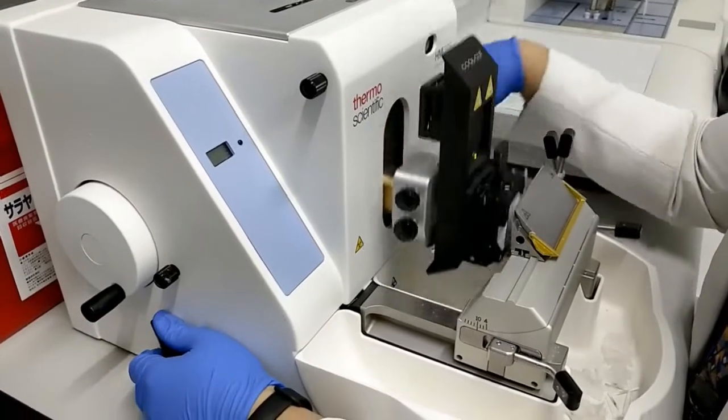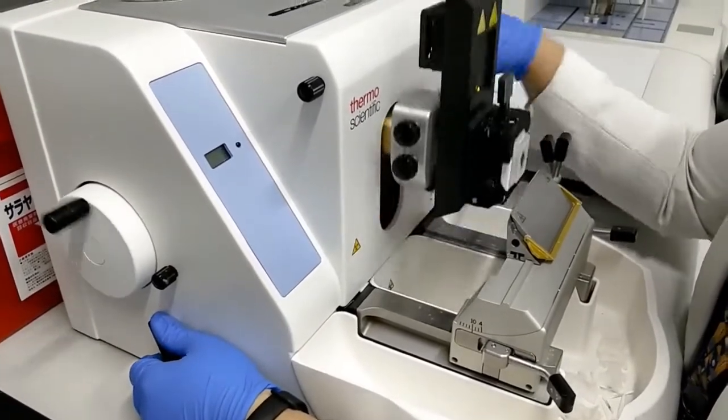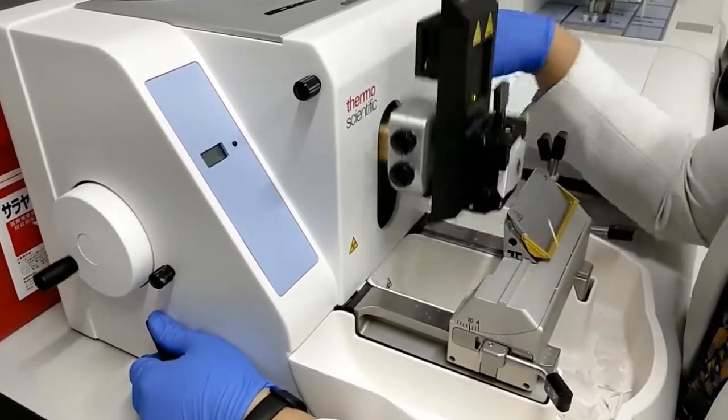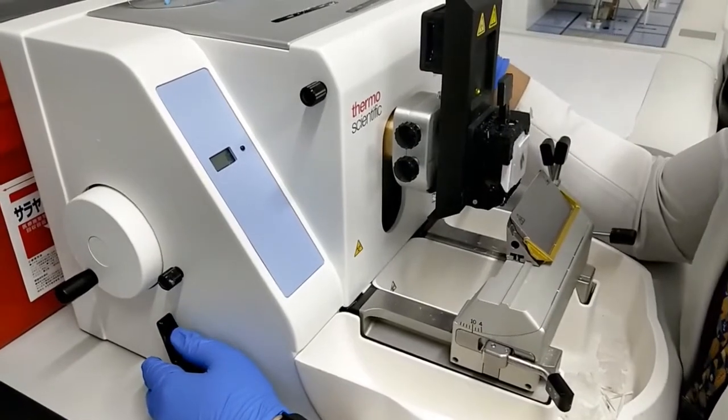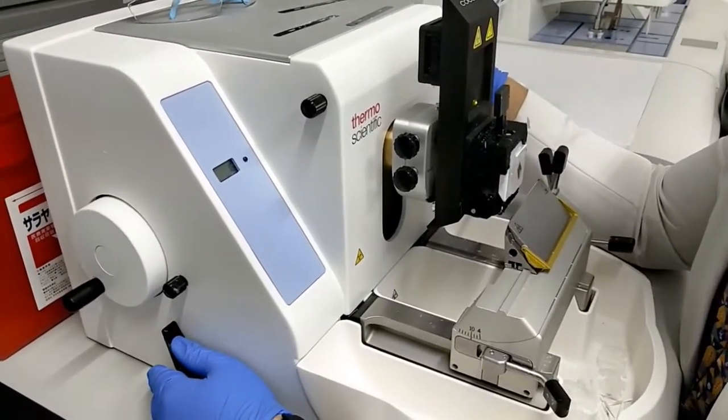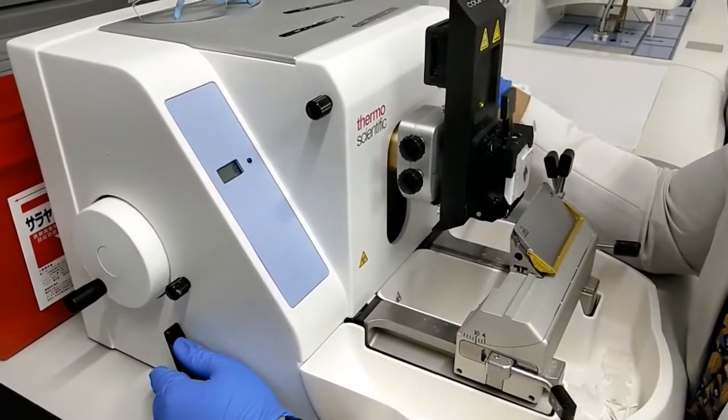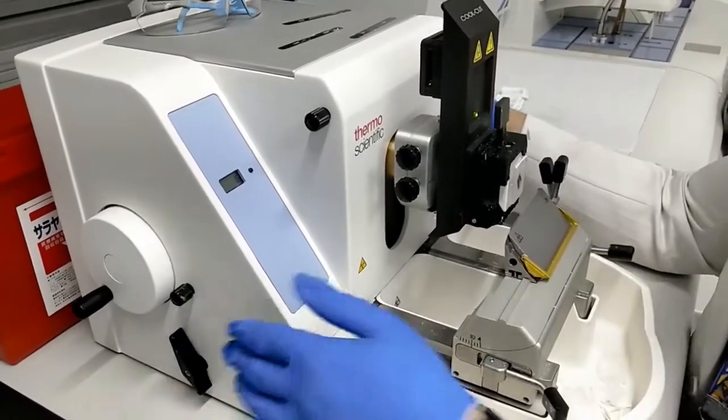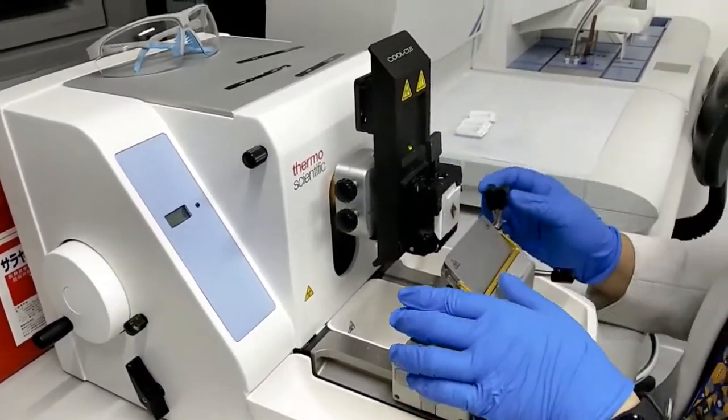Using the trimmer, we've removed excess tissue and excess paraffin wax. Once we're done with the trimming, we can move on with sectioning.